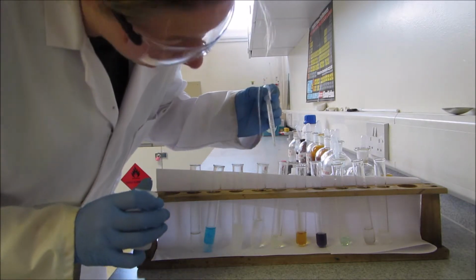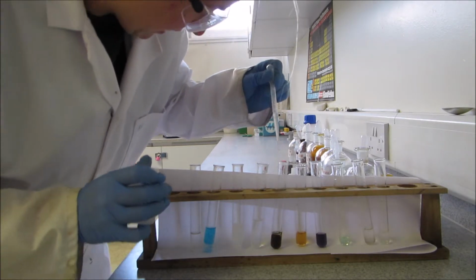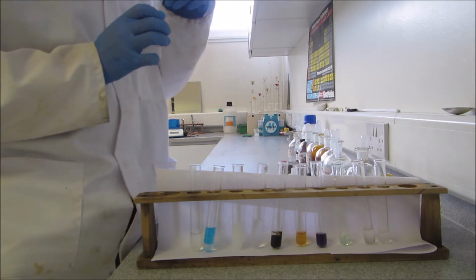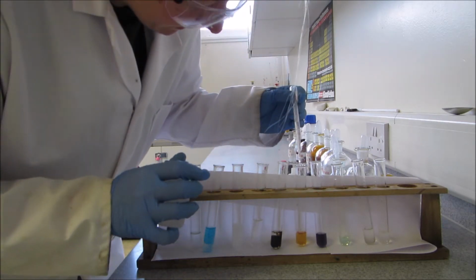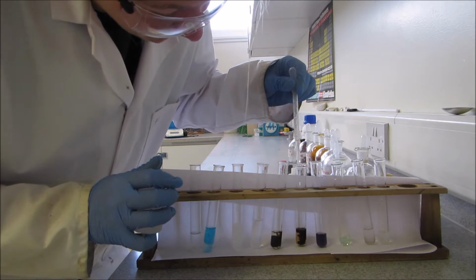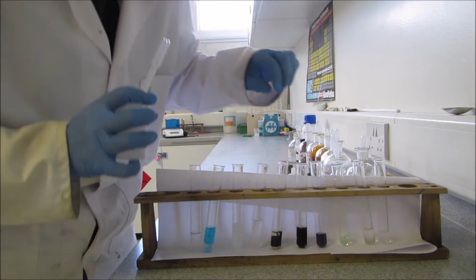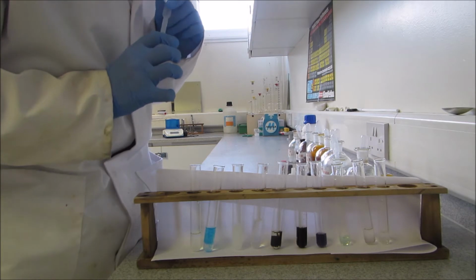So the next one is the iron 2+. As soon as I add sodium hydroxide, a green sort of brown precipitate is formed, and that's positive for iron 2. I don't need to do anything further. Next one is iron 3, and when I add sodium hydroxide, a darker brown precipitate is formed. It's kind of a rusty redder brown, and again that identifies it as the iron 3+ cation.